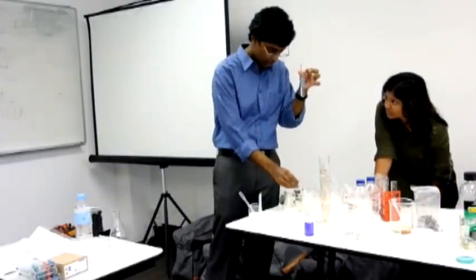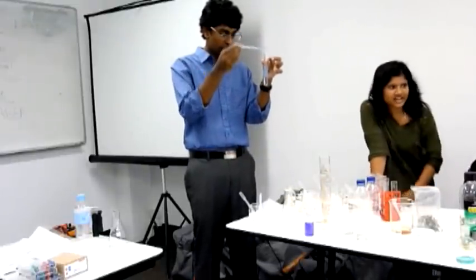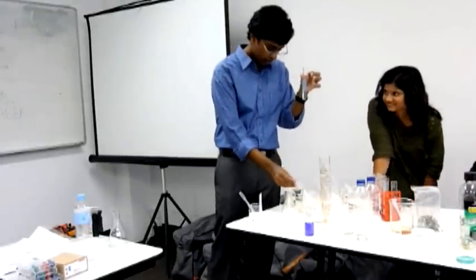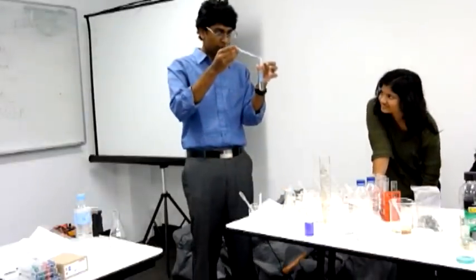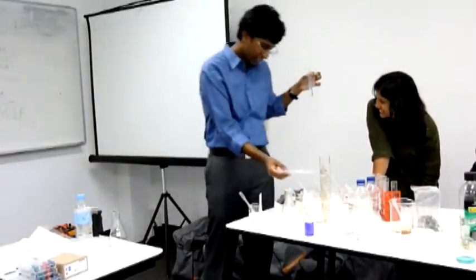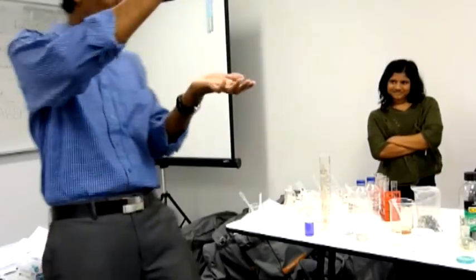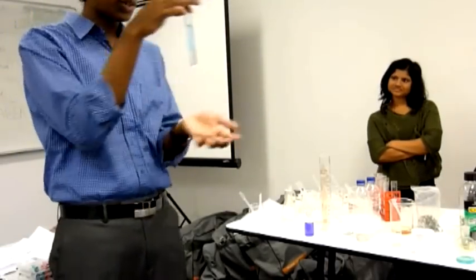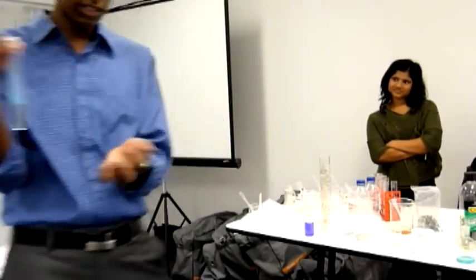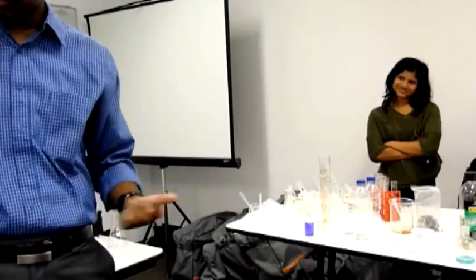Did you guys just see that? Yeah. It's cloudy. What color cloudy? Blue. Deep blue. Not deep light, blue light, baby blue. I think you're looking at his shirt. Yeah, that might be why. Can you see it? Remember when you said, how would you know? No. Because cloudiness. What was it before? It was clear like that? Yeah. But now we know there's precipitate. What color has it gone? Light blue. Good.